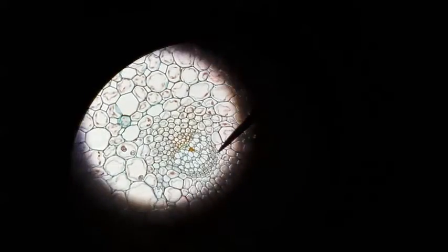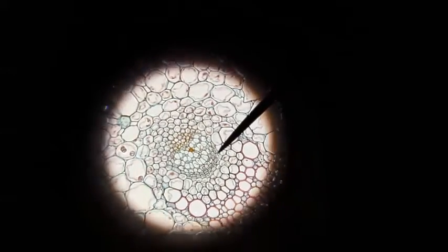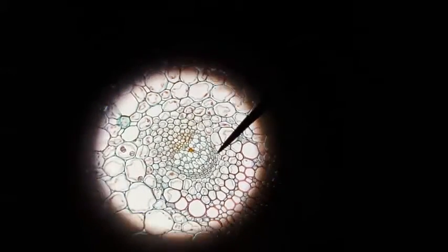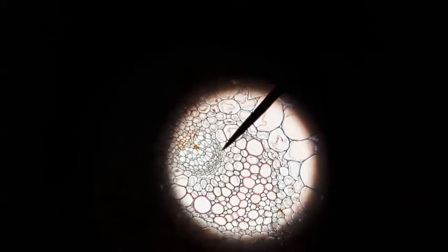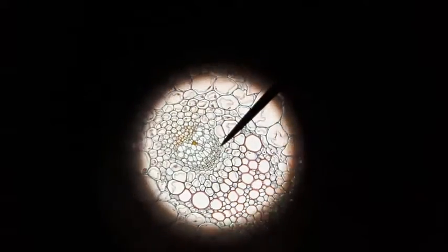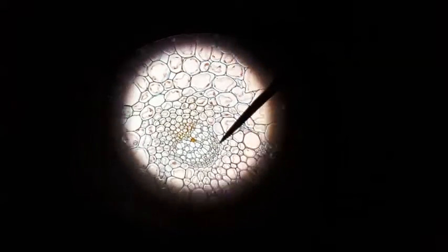On 400x magnification of the dicot stem, this bottom U-shaped area is the phloem, and the area above it is sclerenchyma, and then the bottom right is xylem. So xylem is down here, phloem is this little rim, and then closer in this direction, this part of the island would be the sclerenchyma.